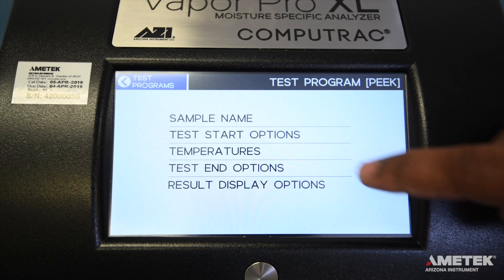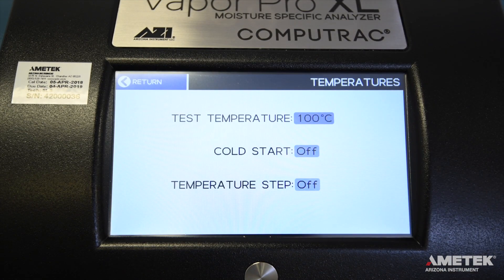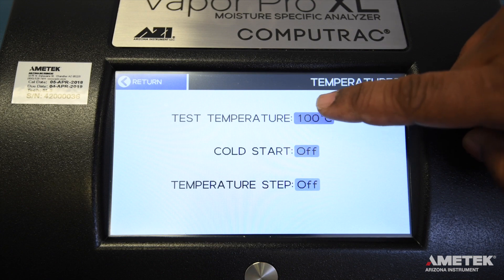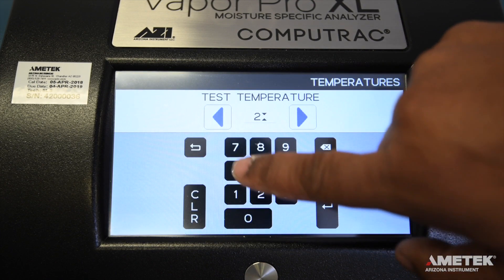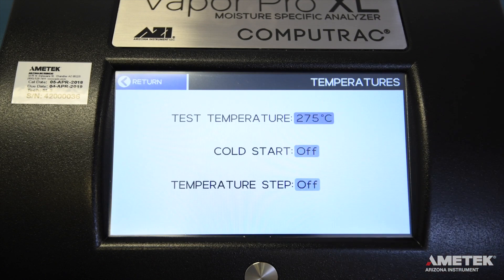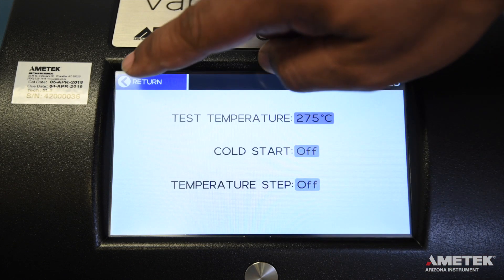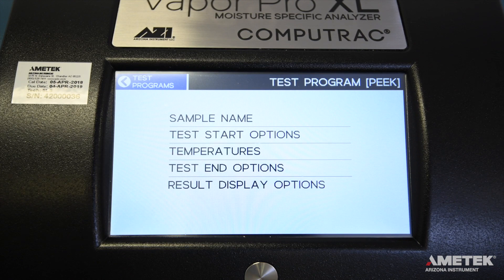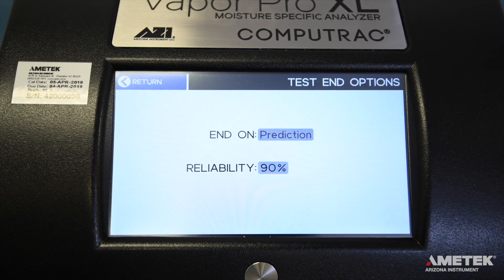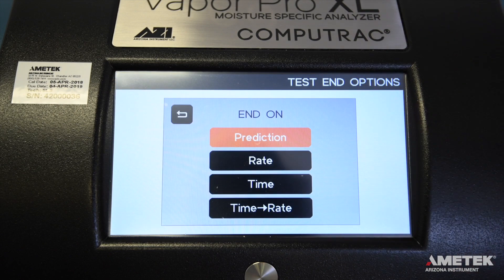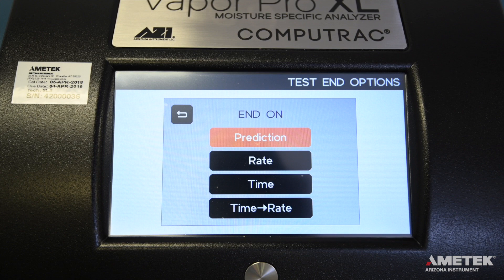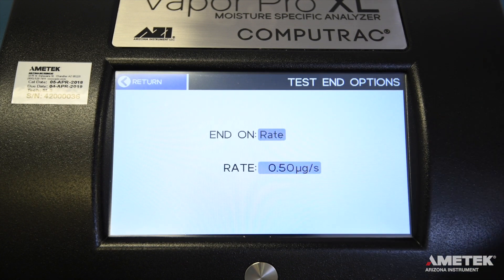The next parameter to edit is Temperatures. On this screen, you'll see fields for Test Temperature, Cold Start, and Temperature Step. Enter your Test Temperature and leave Cold Start and Temperature Step set to Off unless otherwise instructed. The final parameter to edit is Test End Options. The Vapor Pro XL offers a number of ending criteria options, including Rate, Prediction, Time, and Time then Rate. Select the appropriate option and enter the parameter information in the second field.